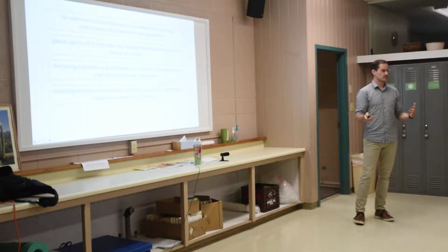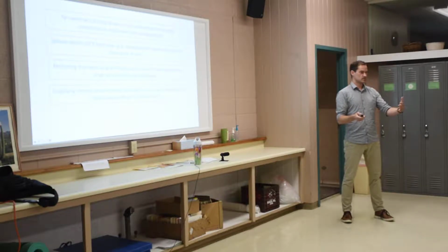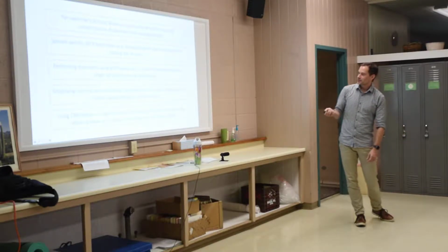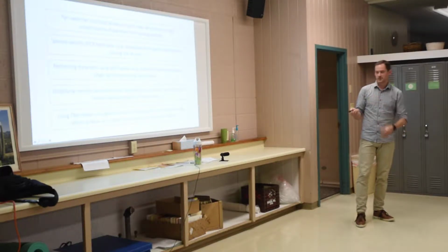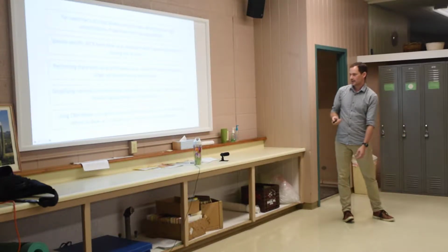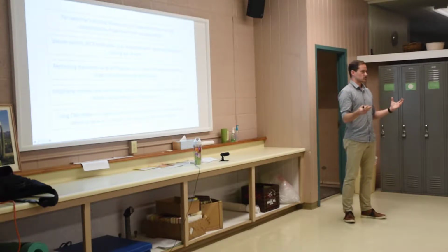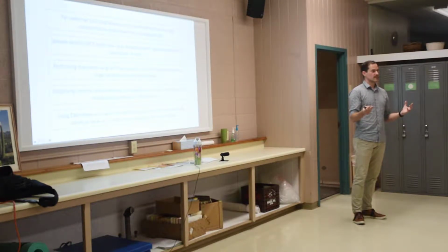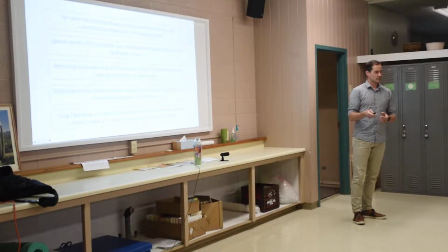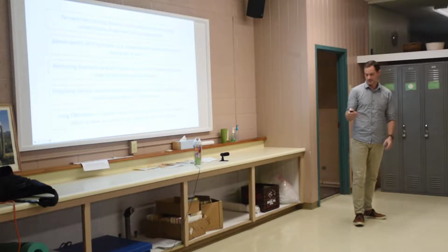So there's not any interpretation, which for those of you who've done Secchi depth using a Secchi disc, you do it, and then your buddy does it next to you, and you might come up with a meter difference in your Secchi depth, right? Somebody maybe just can't see as far down as the other guy. So we think that using CBM, the way we just showed you in the qPCR for the swimmer's itch, allows you to really expand the scope and scale of monitoring efforts. And I think that swimmer's itch story really exemplifies that. That's one lake that we have that for. We have 17 lakes in this study. So we're going to have ridiculous data on swimmer's itch. Okay?